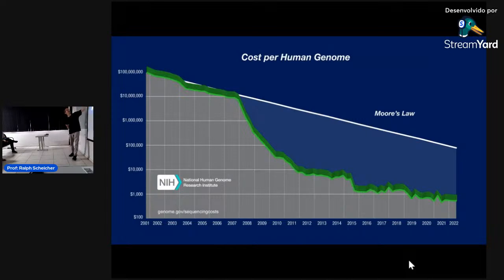a function of time. And I want to notice that this is a logarithmic scale. So this has dropped over 5 orders of magnitude until today's time. And now it is possible to sequence a human genome for something like $1,000 and in less than a day. You can do it with one machine, one person can in principle do it. And this is something that was unimaginable maybe 20 years ago. So some of this progress, this technological progress, was driven by nanotechnology, actually.